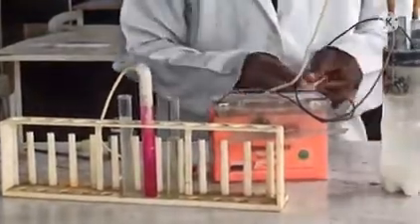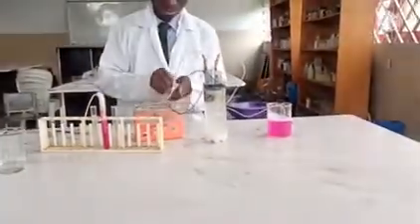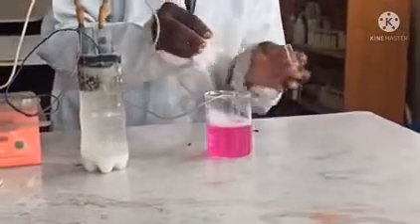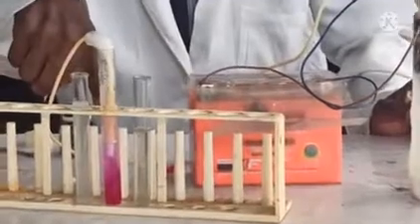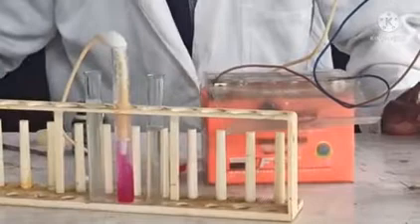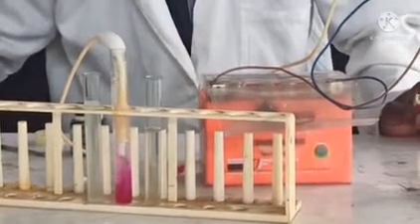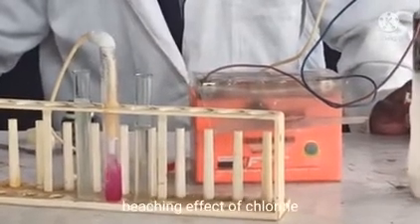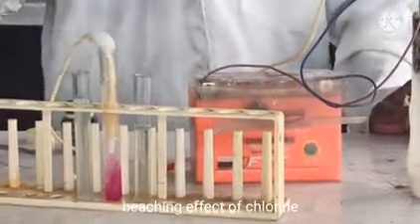At the same time, let me check for the hydrogen — everything is working perfectly. It's producing hydrogen. Let's look at the chlorine again — see how it's bleaching it gradually. You can see the reaction; it's bubbling very well and it is bleaching the solution.